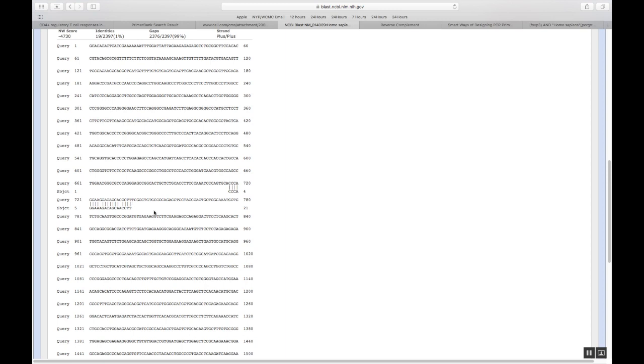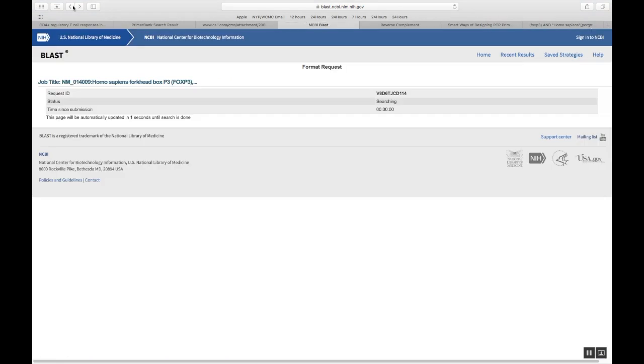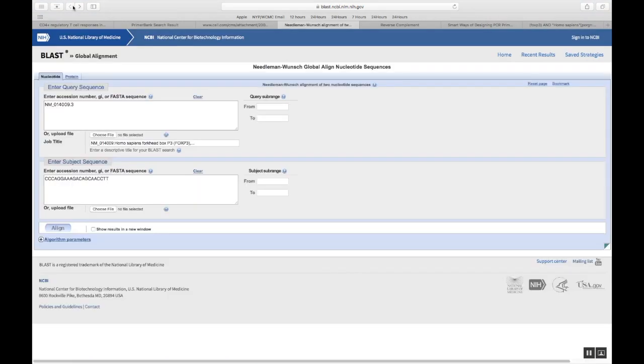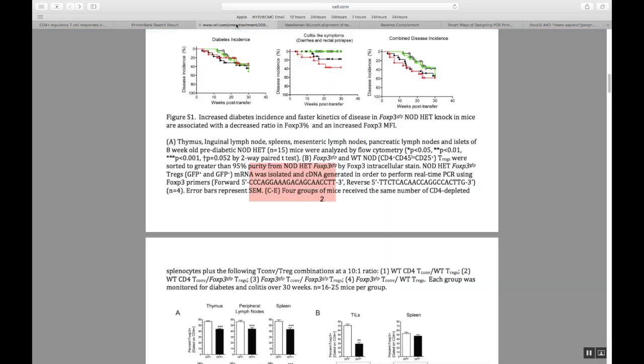We want to find where the reverse primer starts. And then, we will have a sequence between the forward and reverse for which we are going to design a probe. So, now that we have got this, we'll go back. And I'll go here and get my reverse sequence, reverse primer sequence.